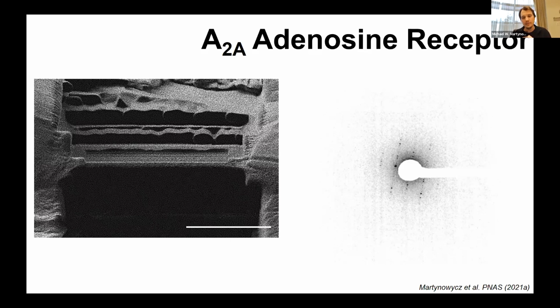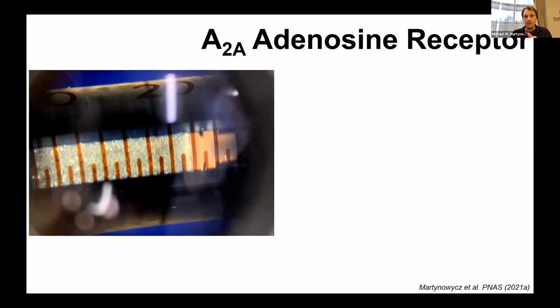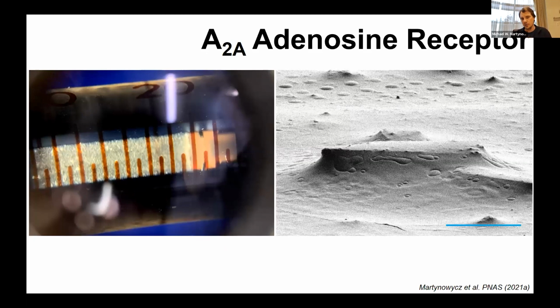So we went back and looked at our crystals and said, they looked very dehydrated. It took about 2 minutes to fish the crystal out of that toothpaste and put it on the TEM grid. That's a lot of time and protein work. So we hypothesized that we could do better and we could keep the crystal hydrated by growing those crystals instead of in tiny little drops inside of a glass syringe, where you can see this LCP tube here full of crystals surrounded by liquid. We ejected all the extra water out of this, leaving only the LCP behind, and mixed it with something called PEG, which flows and just acts like a liquid, giving us this beautiful slurry. Put that on the grid and got beautifully hydrated crystals.